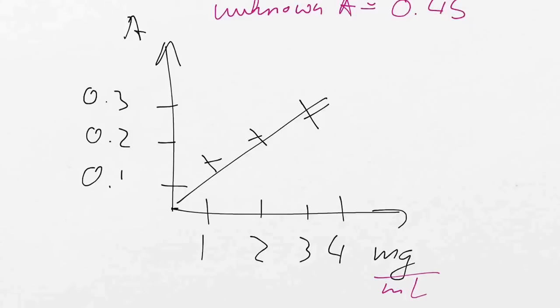No? Why not? Why can't I do that? It's outside your data range. It is outside the data range. Thank you very much. What that means is my absorbance would be here. I would need to extrapolate and hope for the best. That is what a lot of people do wrong. And then they say, oh, well, it's up there. I just simply extend the standard line and do that.